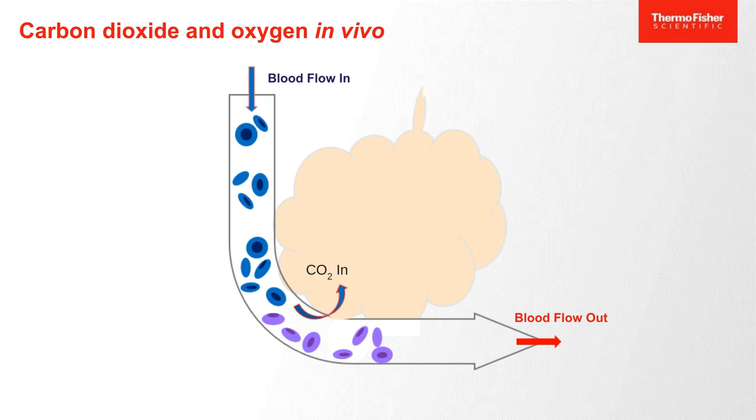Carbon dioxide is the second biggest parameter provided by the incubator. And so I want to review, I think many of us don't really think about why we provide CO2. We know it's required for cell growth, and we know it's there to balance the pH of the growth medium. But this system is actually based on the physiological conditions in the bloodstream and the lung. So this is my drawing of a blood vessel entering a lobe of a lung.